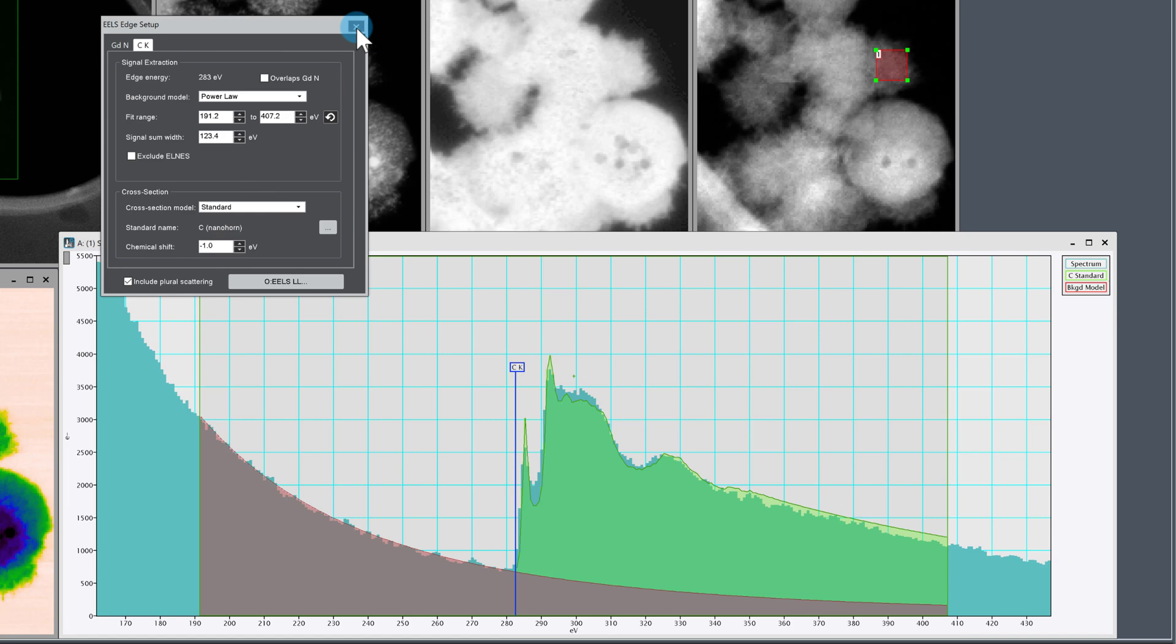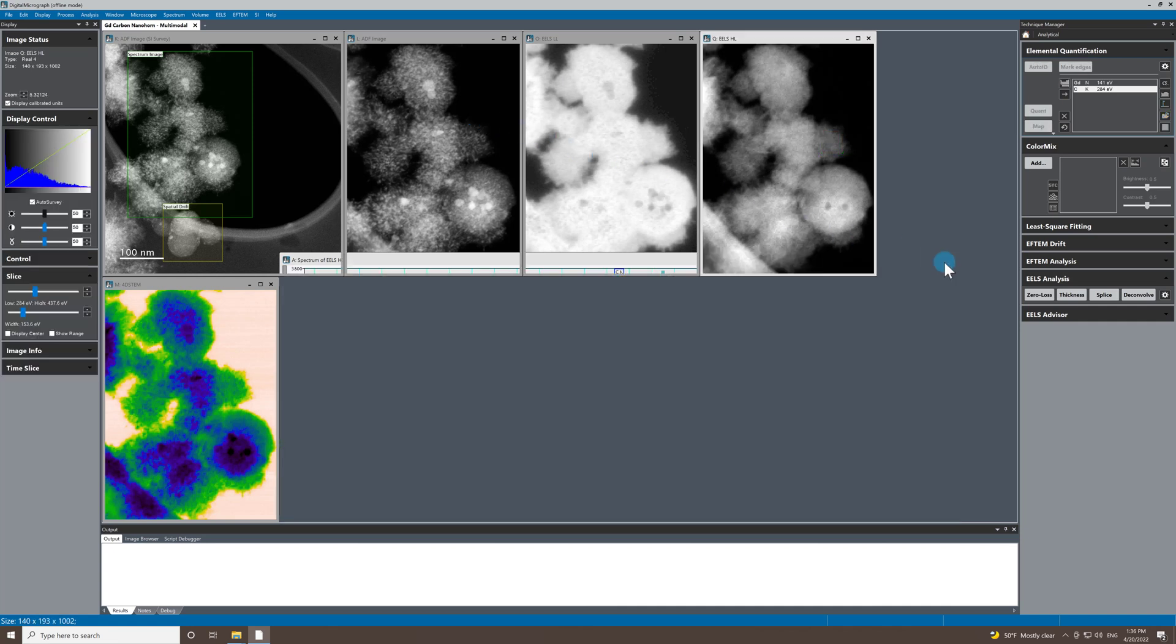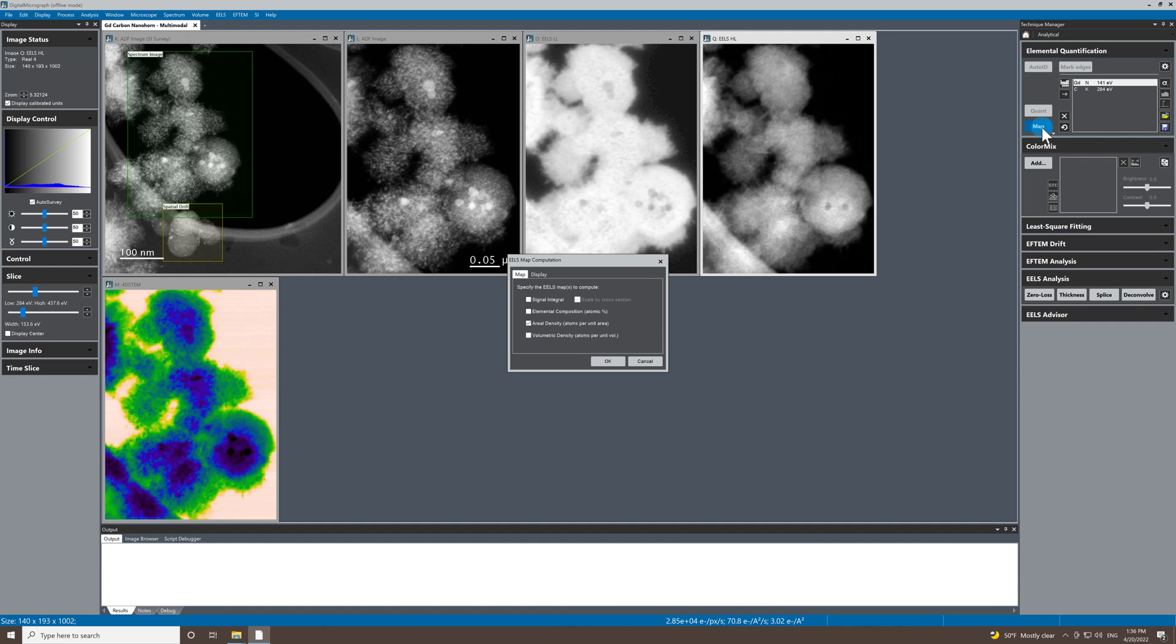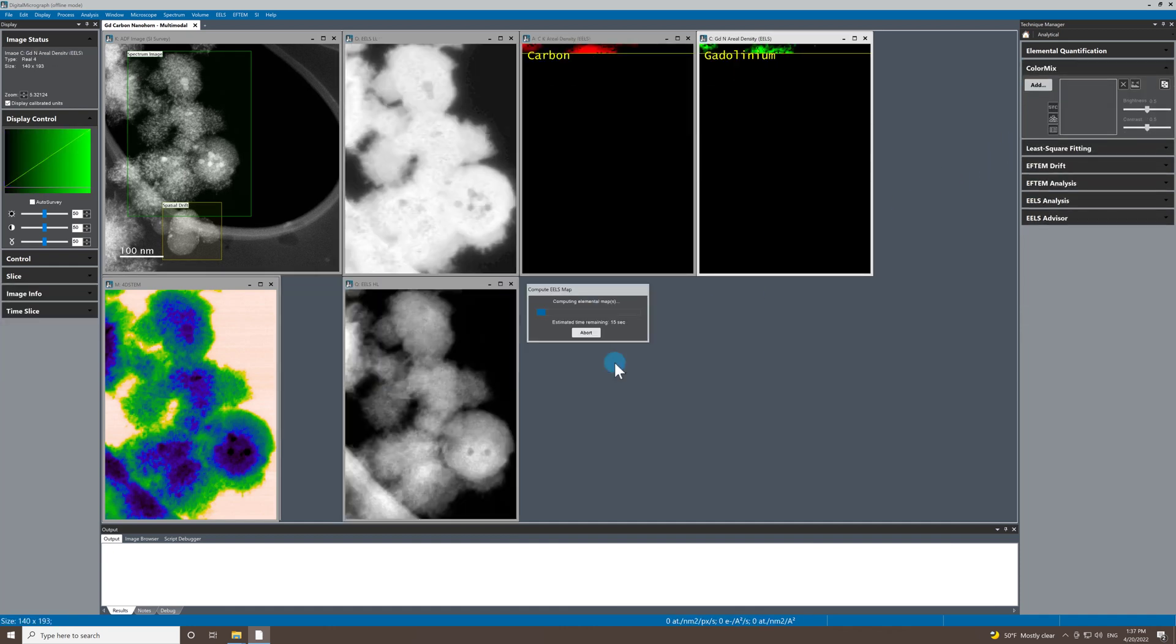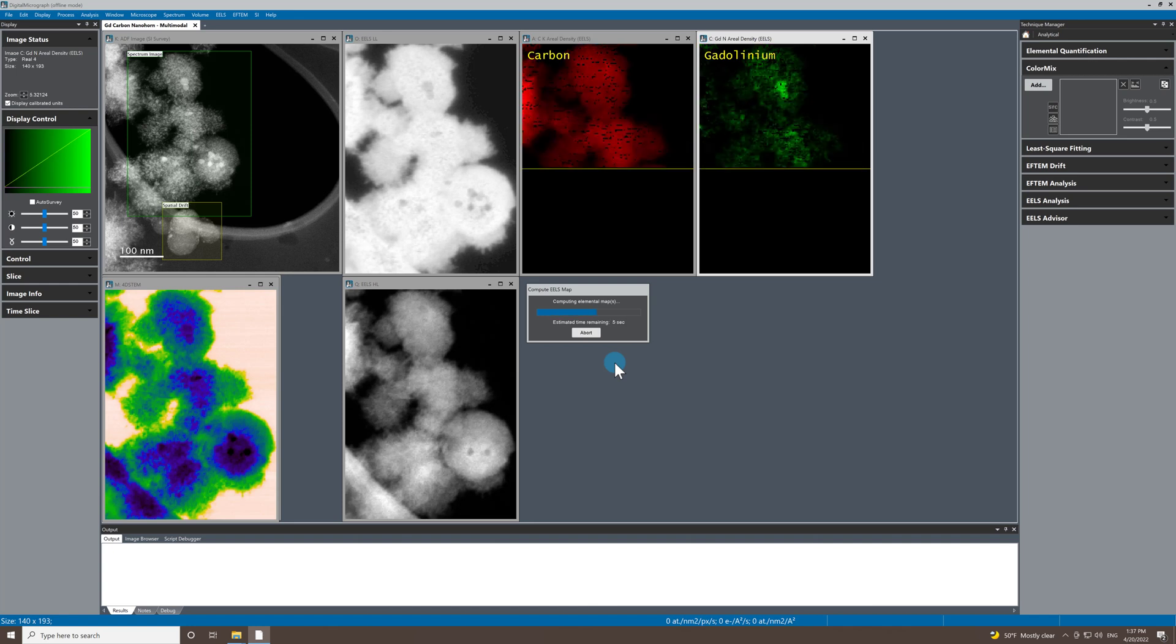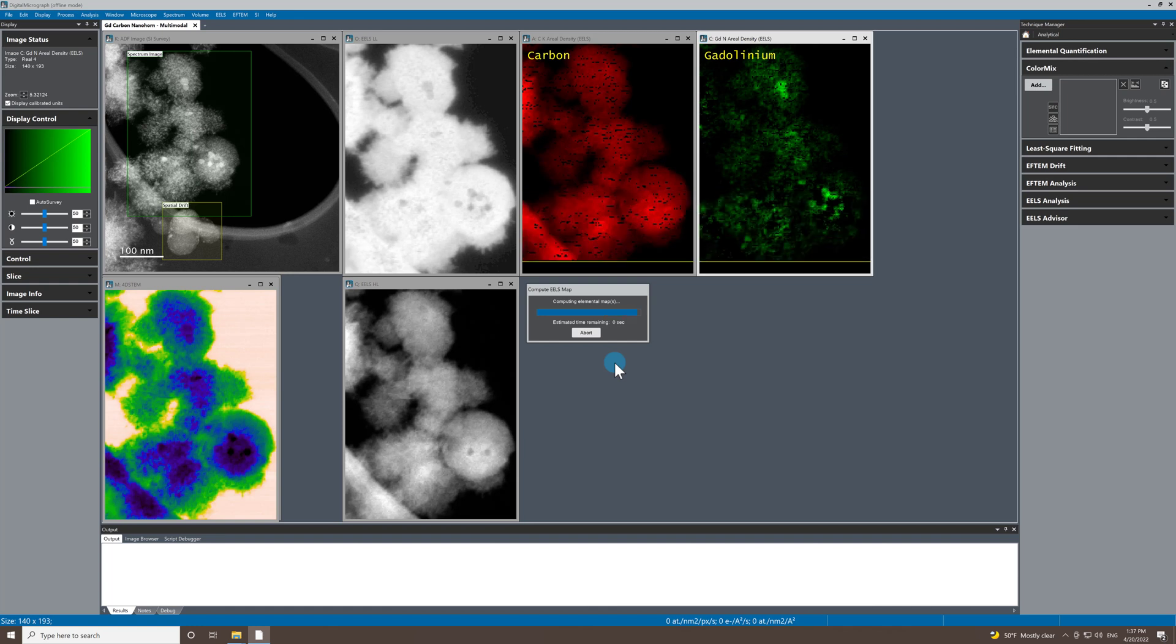Okay. So I'm happy with the fit parameters. I'm just going to go ahead and map. So let's map and let's plot aerial density maps. I'm going to press okay and generate those maps. So carbon K aerial density and gadolinium N aerial density. Let that finish.